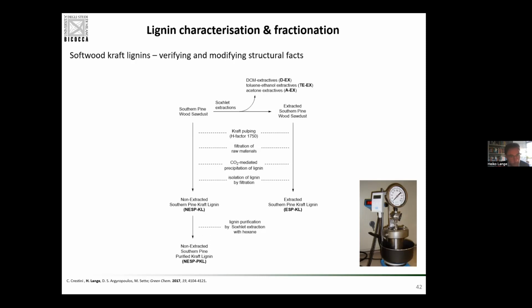And now you might say that if it's such a little aspect of the structure that I don't see it if I do the bulk material analysis, it's probably not worthwhile thinking about it. For some applications, that is completely true. For some other applications, that might be the factor that makes the application fail. Because if I have a small impurity with a very, very, let's say, particular chemical characteristic, that might screw up my intended application. So it's better to know that it is in there.